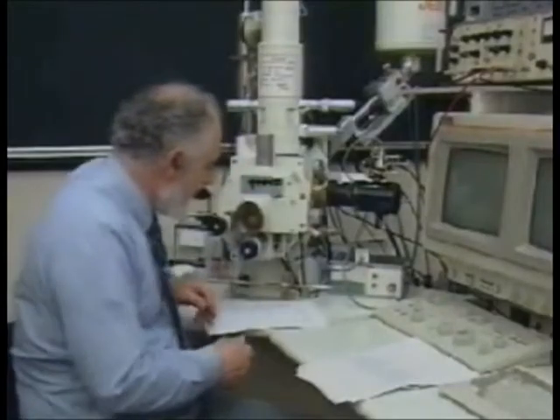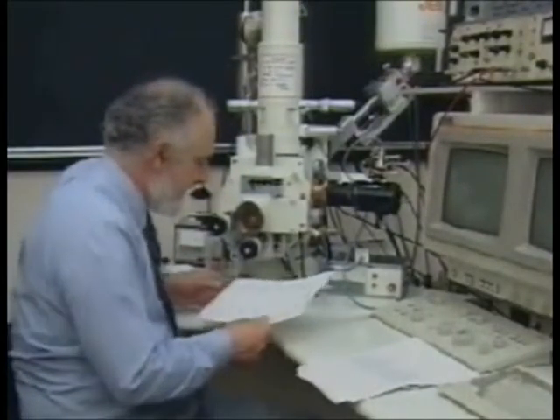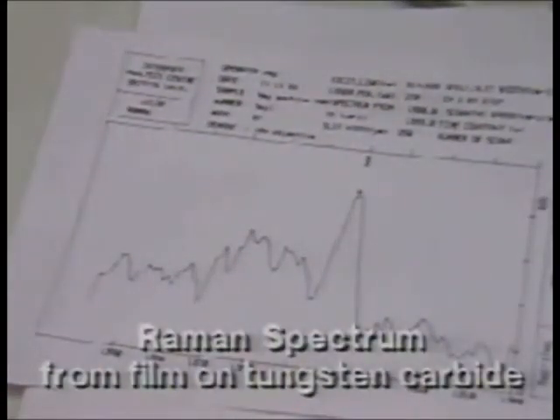And if we continue to remove that material, then we observe the tungsten carbide substrate on which the film had been grown. And finally here, we're looking at the Raman spectrum. In Raman spectroscopy, we're looking at an absorption line, and for diamond we would expect that absorption line to occur at, in fact, 1331, 1332 wavenumbers, centimeters to the -1.